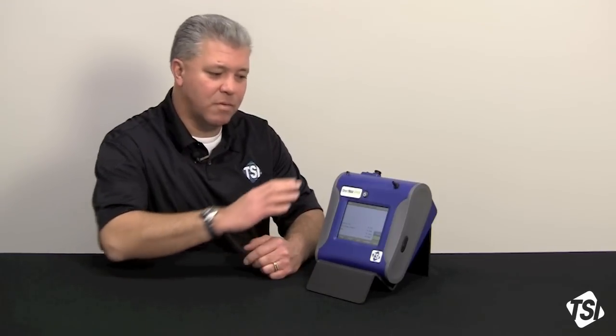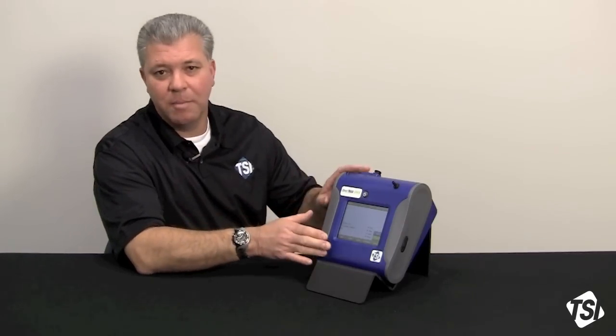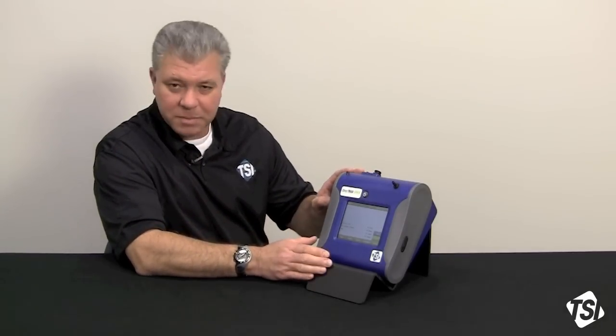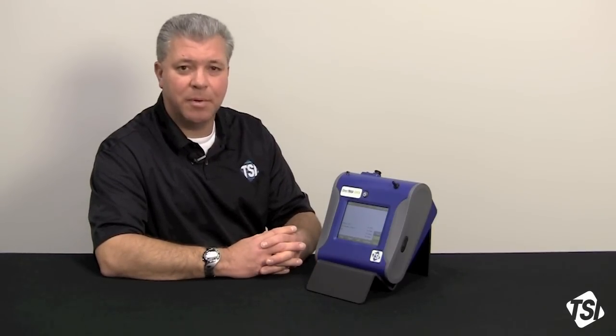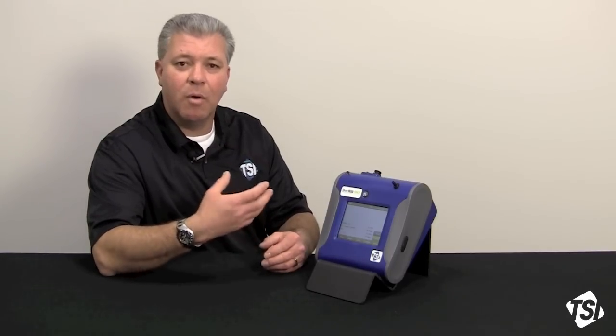Today we're going to be going over the DustTrak DRX, which is similar to the DustTrak 2 in menu format. What we're specifically going to do today is go through how to program a DustTrak 2 or DRX to sample either in survey mode, which is a non-logging mode, or manual logging mode, which is a quick setup mode for logging, and a program log mode, which is a much more detailed sample program that can be run for extended periods of time or to be able to conduct multiple samples.